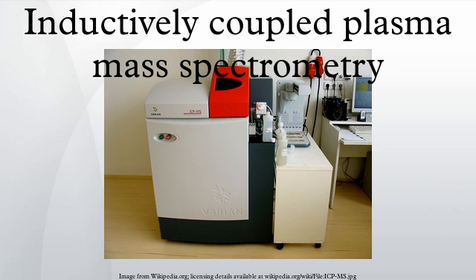This technique is also widely used in the field of radiometric dating, in which it is used to analyze relative abundance of different isotopes. ICP-MS is more suitable for this application than the previously used thermal ionization mass spectrometry, as species with high ionization energy such as osmium and tungsten can be easily ionized.